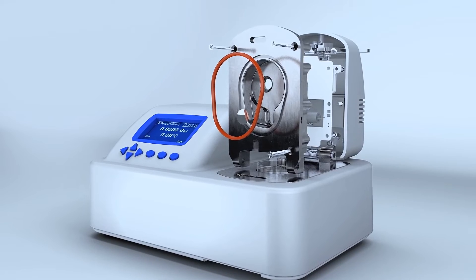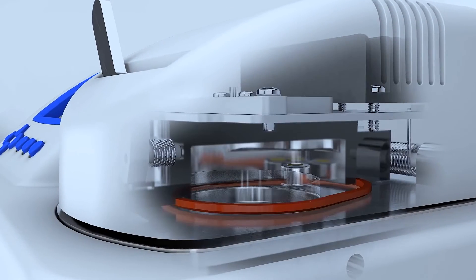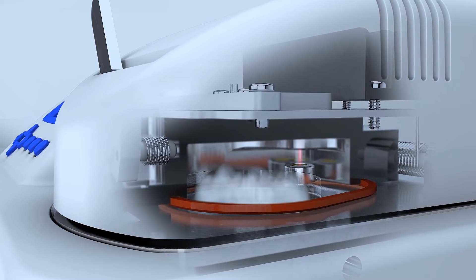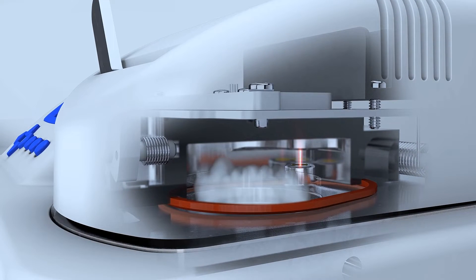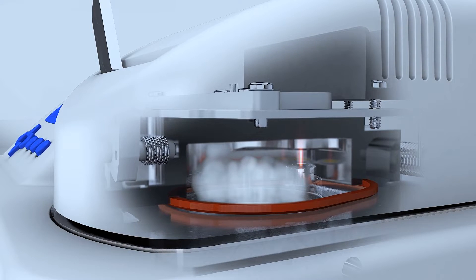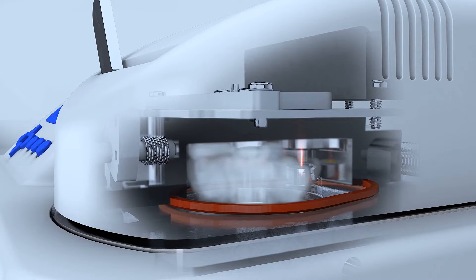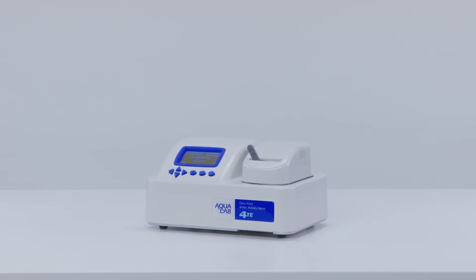To understand how it works, let's look at the inside of the sample chamber. When a sample is put into the chamber and the block is sealed, it comes to vapor equilibrium. Water molecules enter the air above the sample, and then the mirror is chilled until dew forms. The chilled mirror method is a primary measurement method, and it's the fastest, most accurate way to measure water activity.